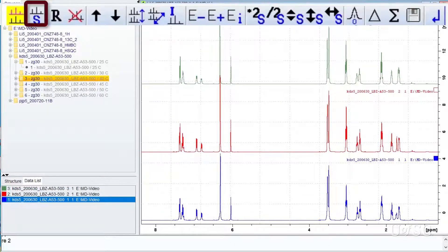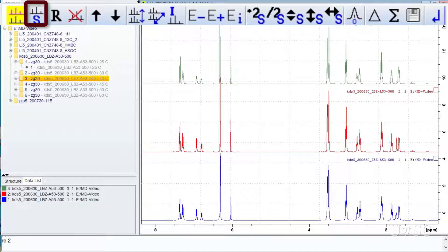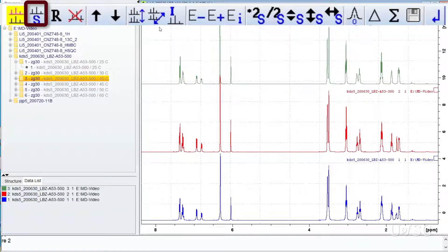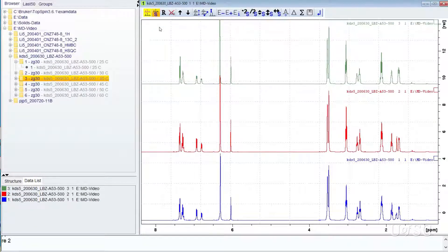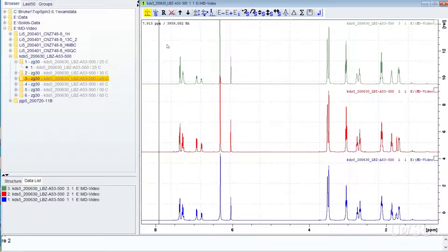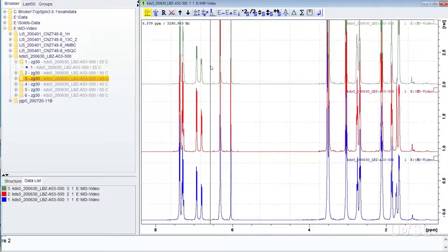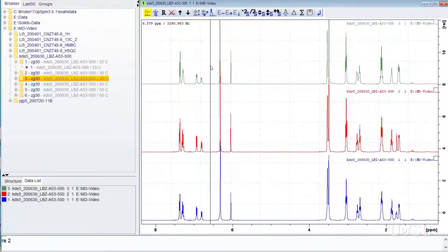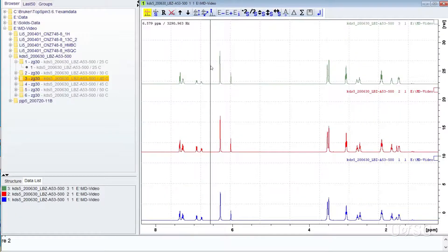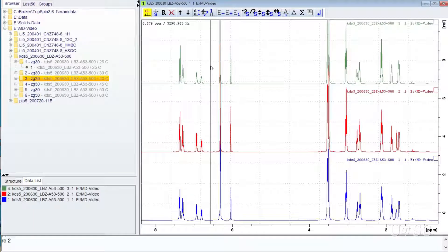The first button that has an icon with an S under a spectrum will allow you to deselect all the data sets. When no traces are selected, the mouse scroll wheel will adjust the vertical intensity of all the open spectra.